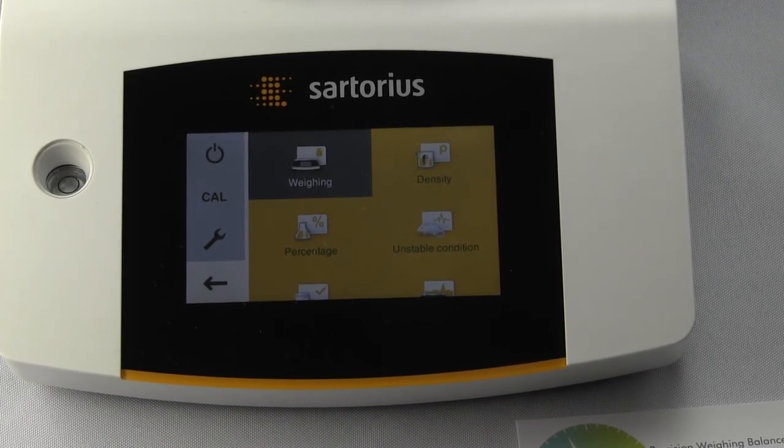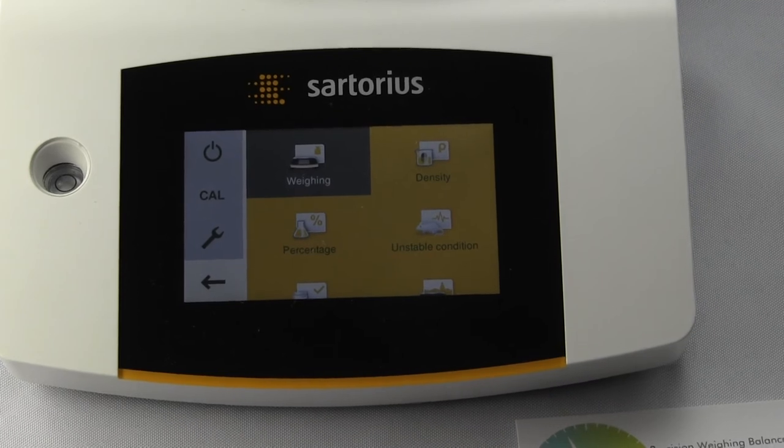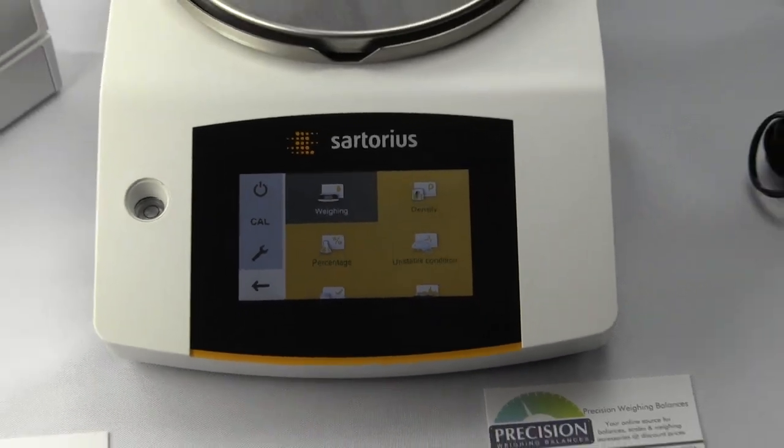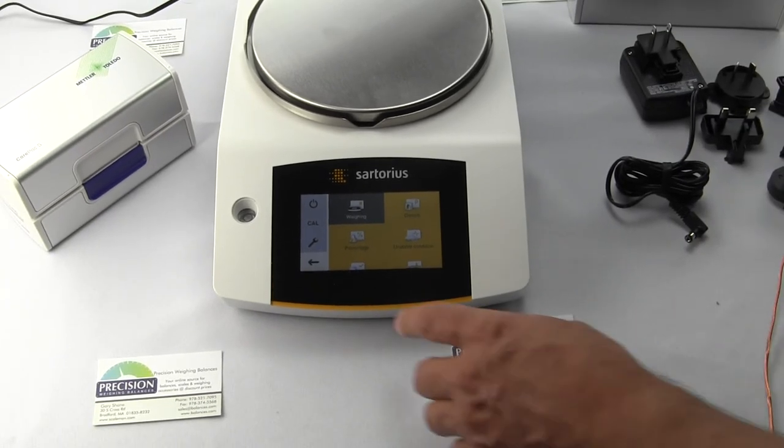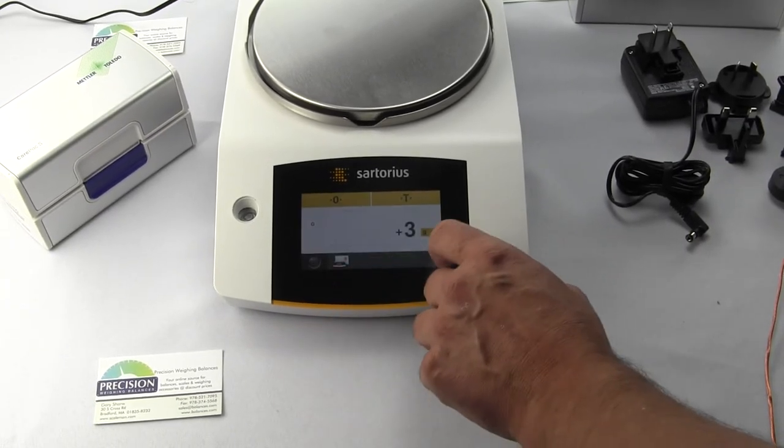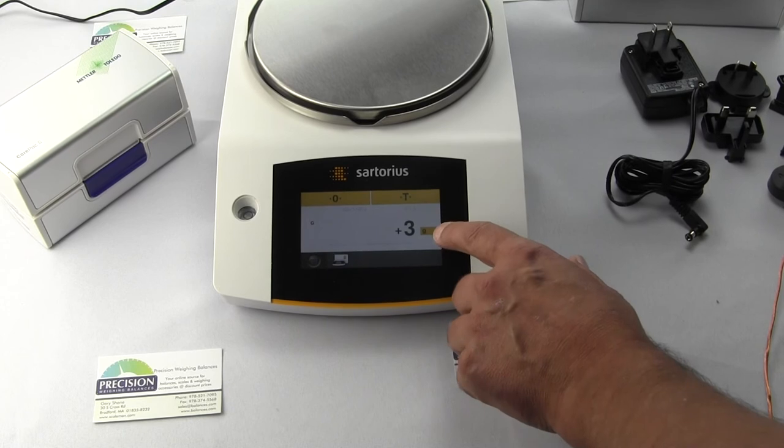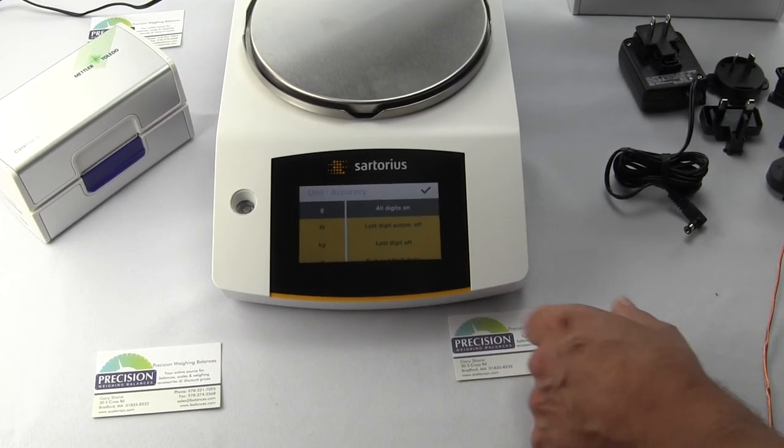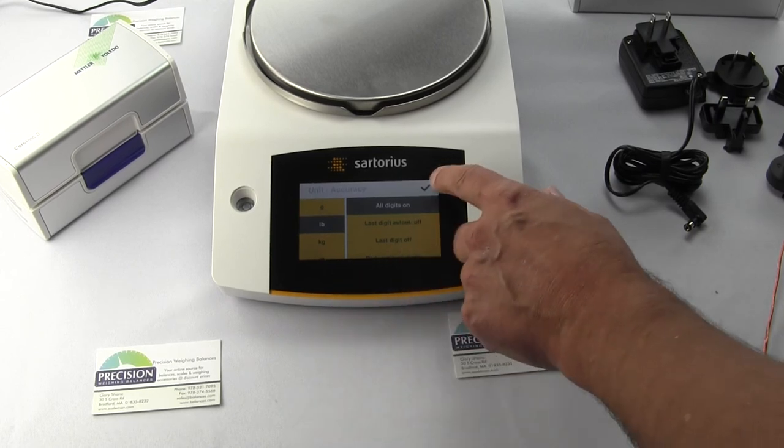Laboratory science classrooms and quality control looking for a nice gram scale, this could be the perfect solution—the Practum series. This particular model increments in one gram divisions. To change the weight mode, right now we're in grams, you can go to pounds. Very simple to tare—just hit the tare button. It's a very intuitive balance.